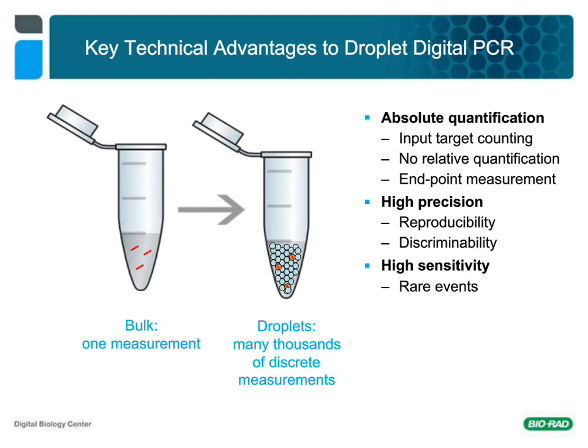The key technical advantages of ddPCR are summarized here. First, because each droplet is a yes-no answer for your target, ddPCR simply counts the number of input molecules. Your output in copies per microliter tells you how many amplifiable DNA molecules you screened. There is no standard curve, and because we read at endpoint, there is minimal worry about PCR efficiency. This is especially important on degraded clinical samples.